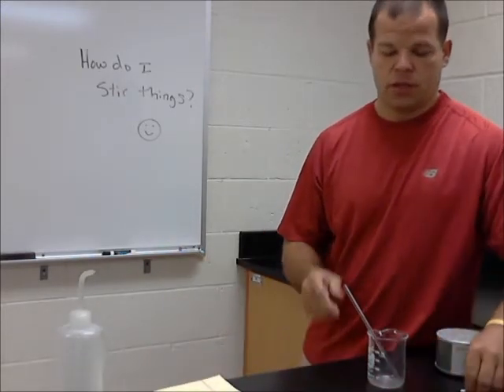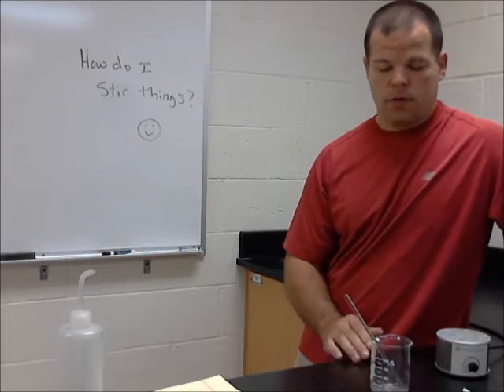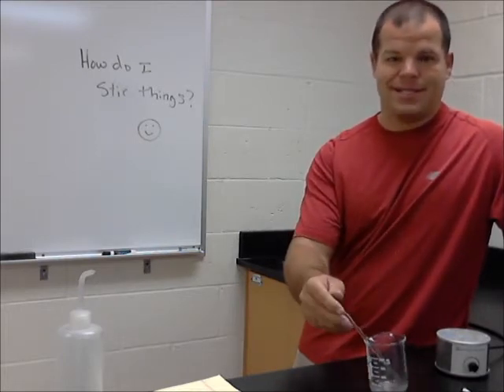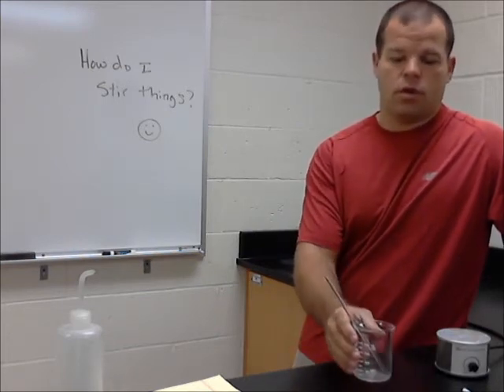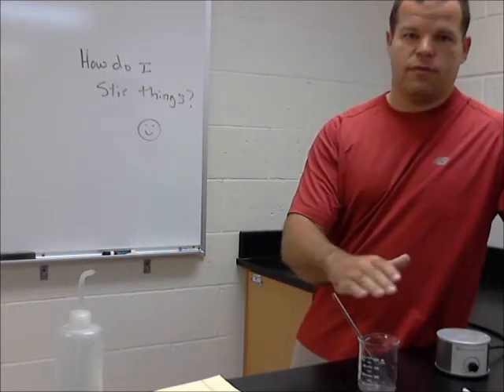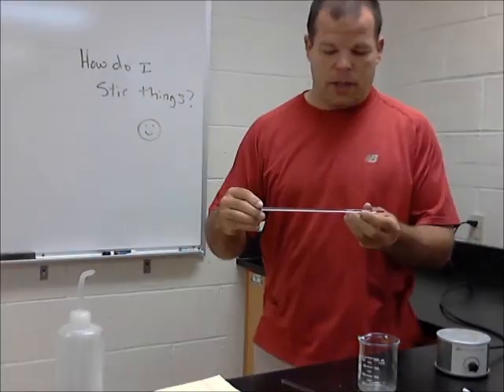No big deal. A couple things to point out about this device: if we leave a stir rod in a beaker, this is one place where someone comes along and catches it and tips it over. That can be an opportunity for a mistake to occur — it's a danger point. So be aware and try not to leave a stir rod in a beaker.